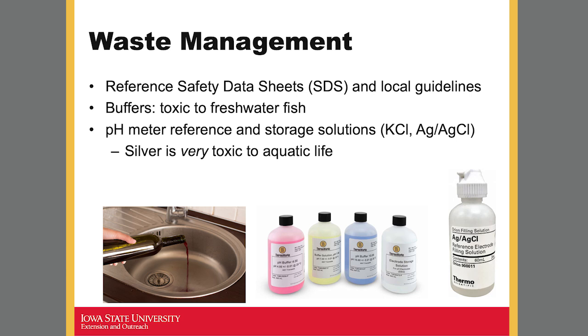And so those are toxic to freshwater fish, according to the SDSs that I checked. So just being conscious of that, try not to dump those down the drain. Similarly, the pH meter reference and storage solutions. The storage solution that's in the little vial at the end of a probe, that's commonly potassium chloride.